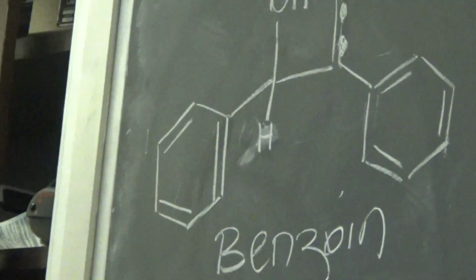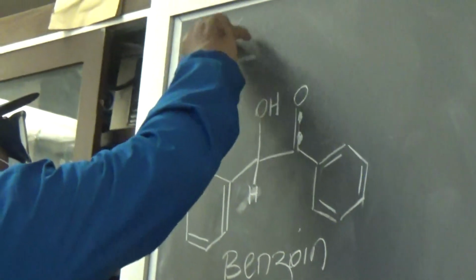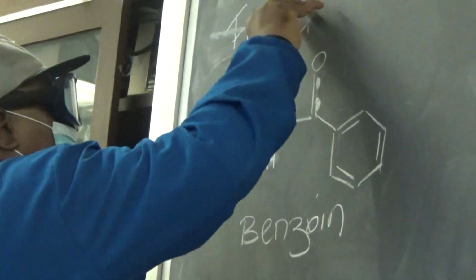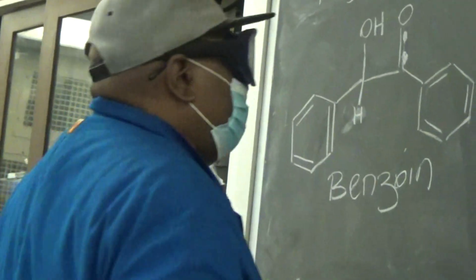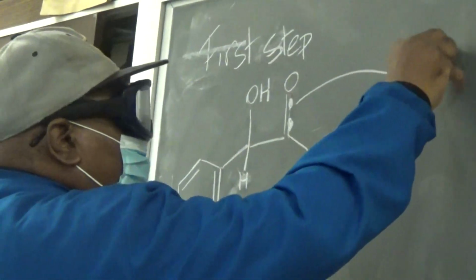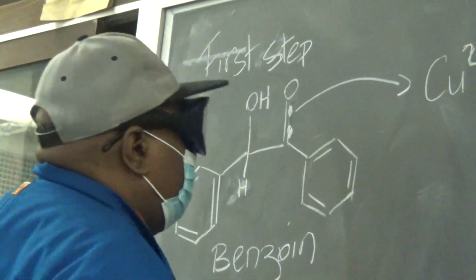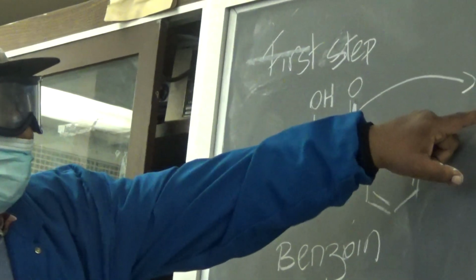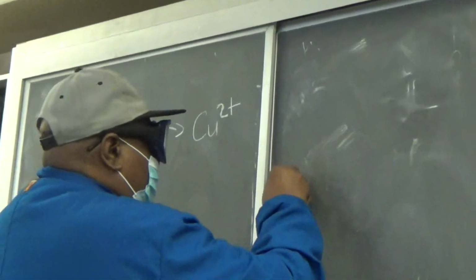So, first step. This one here goes to copper 1.